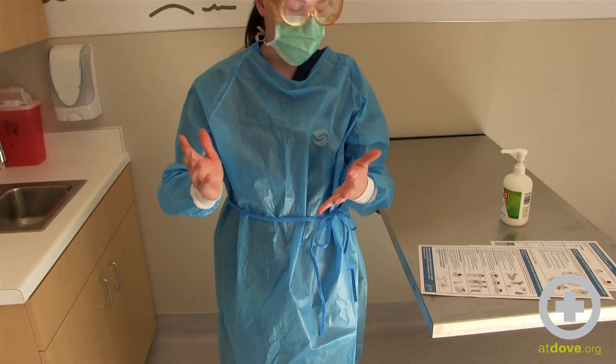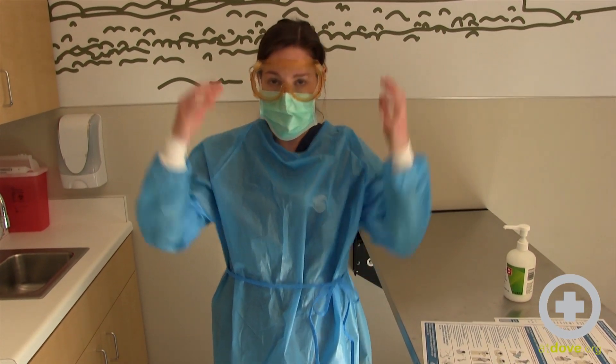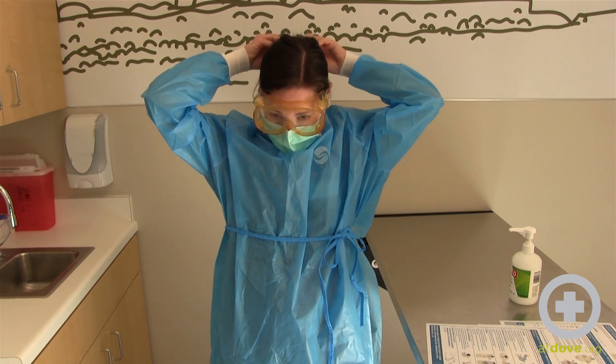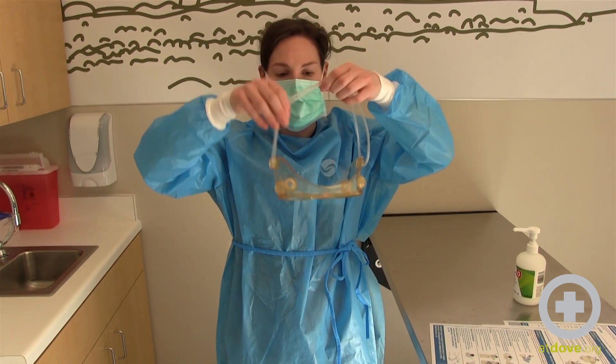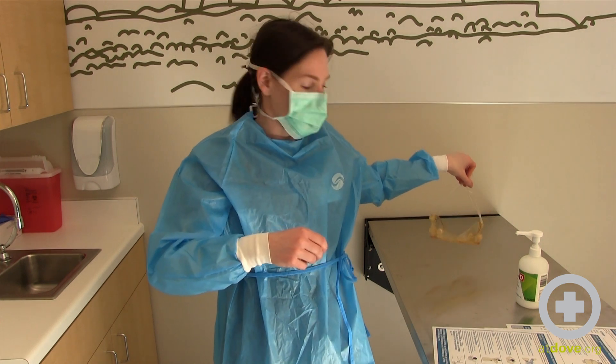Next step is to remove your goggles or face shield. Remember that the front is considered contaminated, so you want to just take off from the back and place these where they will be out of the way and able to be disinfected.